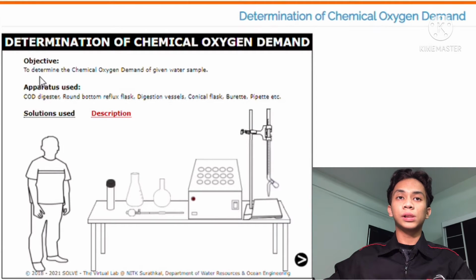Apparatus used: COD digester, round bottom reflux flask, digestion vessels, conical flask, pipette, etc.